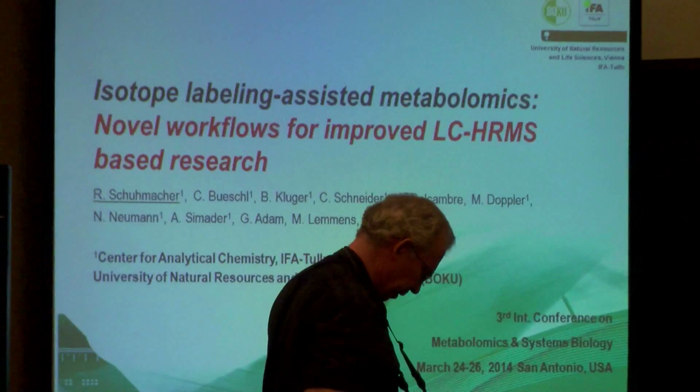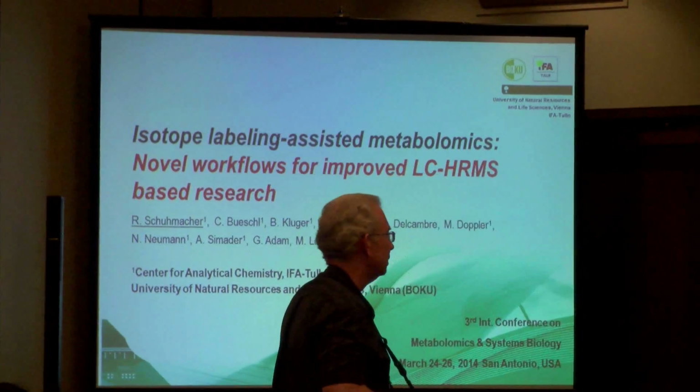We will switch gears again and talk about LC high resolution mass spectrometry, and I would like to show you that the use of stable isotopes could be efficiently used to tackle some very basic problems which we are facing in untargeted metabolomics. This has been said a few times already during the conference.